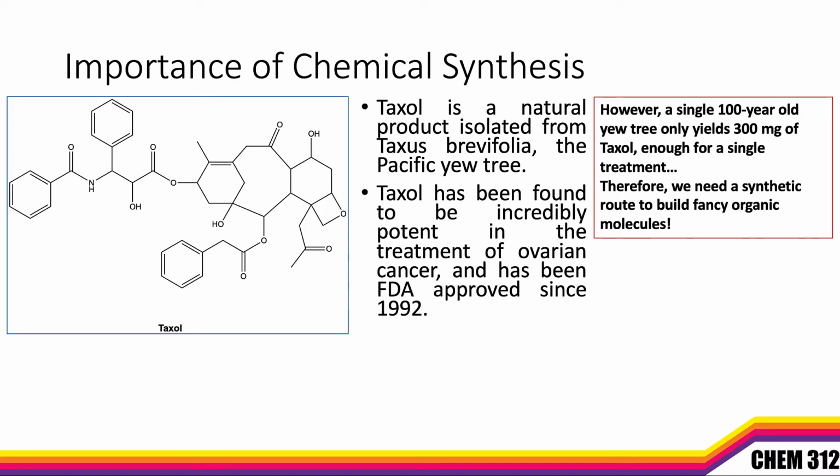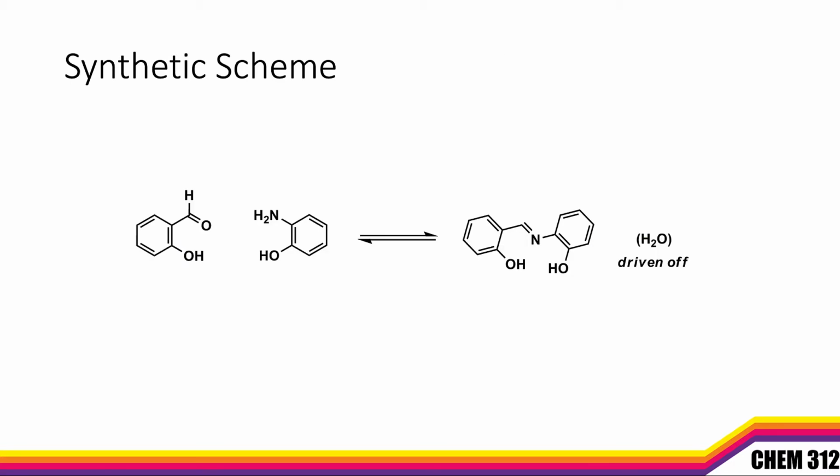Well, this week we're actually building the imine functional group. So this is a reaction you should learn about in lecture. If you haven't learned about it yet, you will see it very soon. And it's the condensation or reaction of an aldehyde with an amine. So we can find our aldehyde on our starting material here. This is salicylaldehyde, this whole molecule. And the aldehyde itself reacts with an amine on our aminophenol to generate this final product.